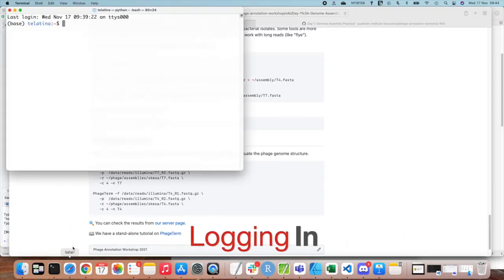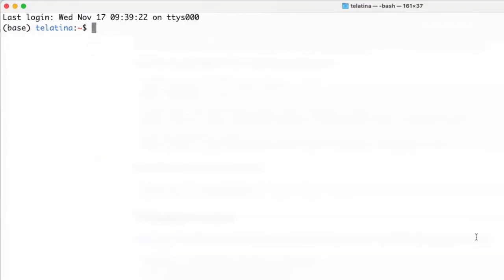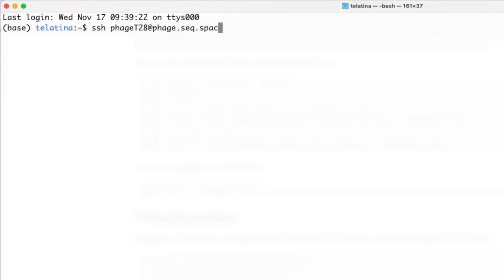To log in to our remote server, we need a terminal. If you use Mac or Linux, you already have one; otherwise you can use PuTTY. In either case, the information needed to log in are your username, your password, and the remote server address. The syntax is SSH, your username at the remote server address, which can be either a numeric IP address or a domain like phage.seq.space in our case.